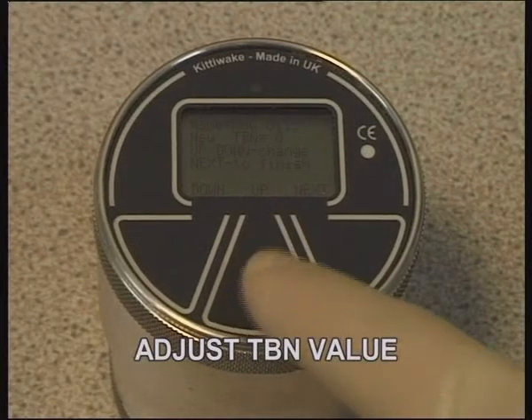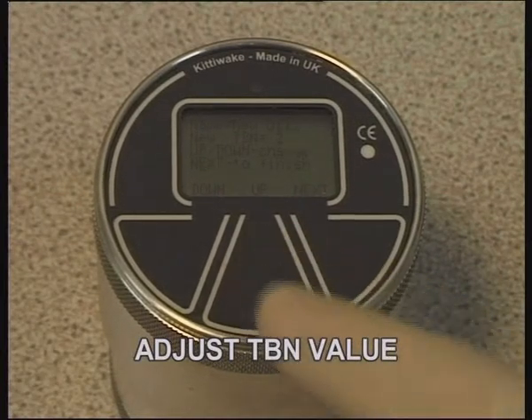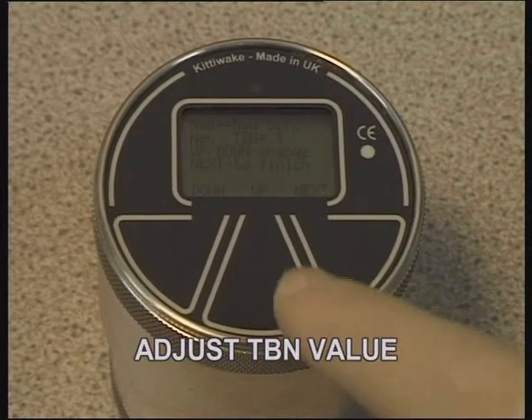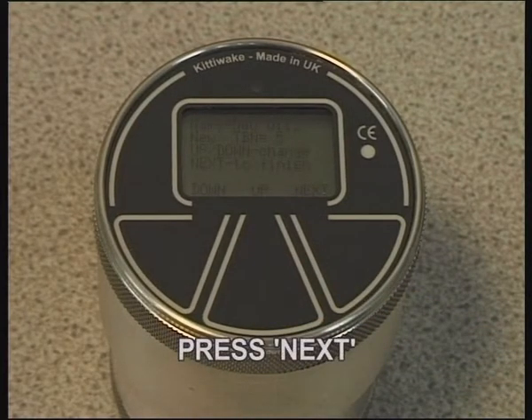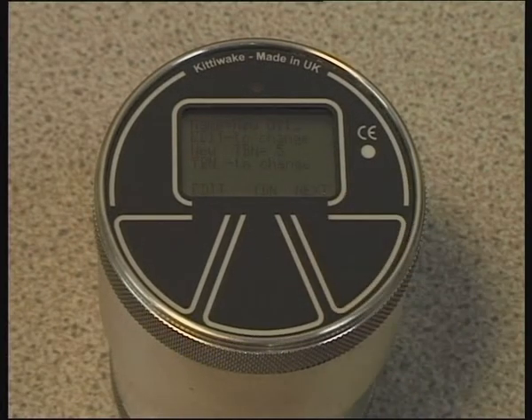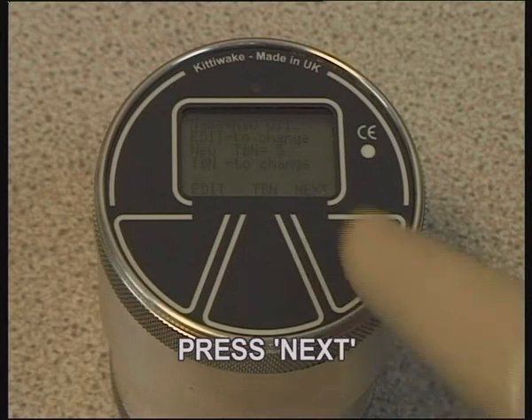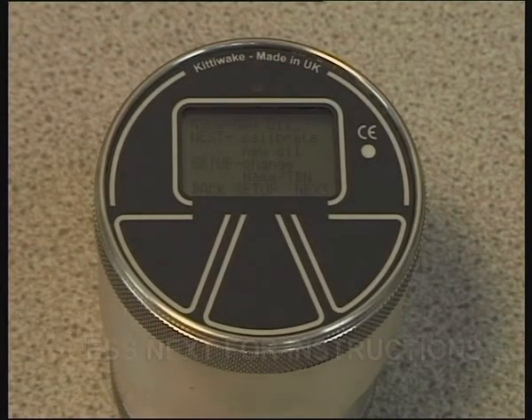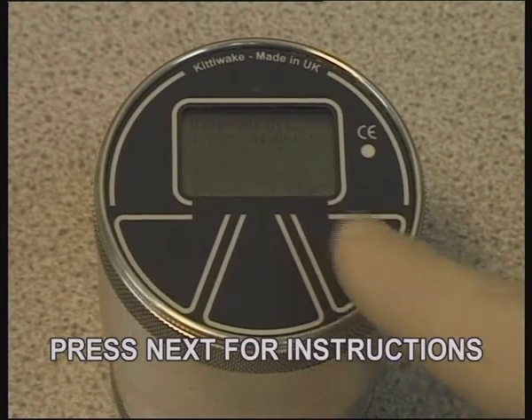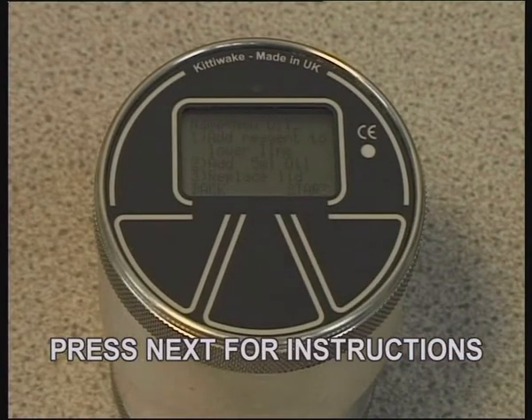Press TBN, then adjust the TBN value using the up and down keys. Press Next to go from the TBN value screen to the oil edit screen. Again, press Next to get to the following menu screen. Press Next once more and follow the on-screen instructions.